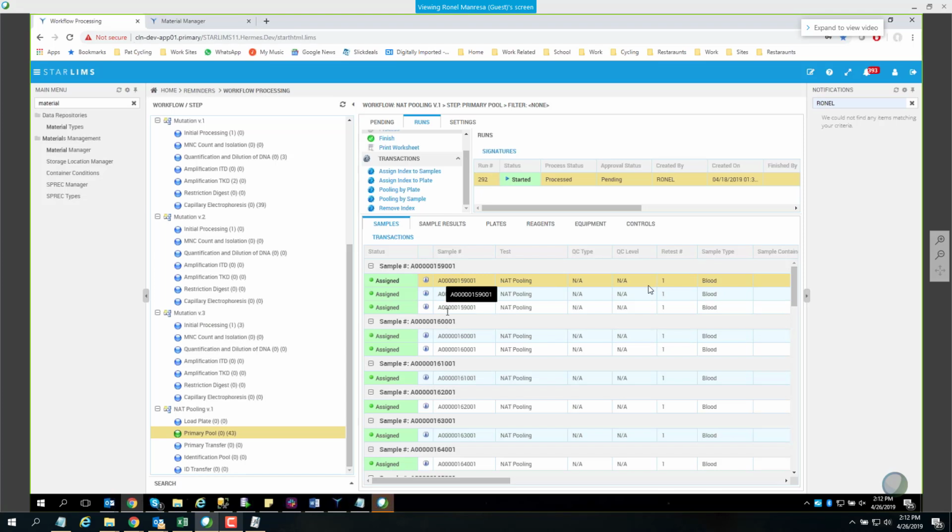By the way, Renel, I am recording this with my Camtasia so that I'm going to share this with Nilka later on, because she's going to have to reuse something like this. She knows this is not in XFD, but the logic is the same, because in her case she has a 384-well plate that I think she has to do the same exercise like 4 times if she wants to assign the indexes to the plate.